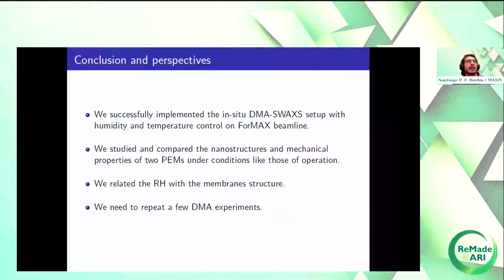And then at the end, as a conclusion, we successfully implemented this new setup that combines DMA with SWAXS and humidity and temperature control at ForMAX. It is available for users. So if you are interested, you can write me and write a proposal.